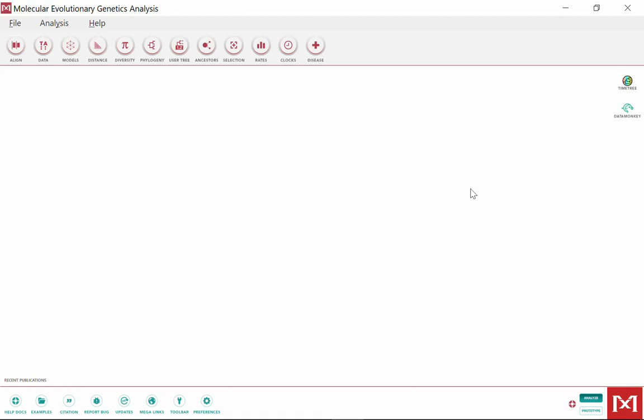Hello everyone. In this recording, I'm going to show you how you can do the analysis for P53, something we went through in the lecture, but I realized it was not recorded. So I'm going to show you what you have to do with the P53 protein sequences that are given to you from the website. Then you can do that by yourself, adding the sequence that you were assigned, and you'll do the same thing for the mitochondrial DNA.